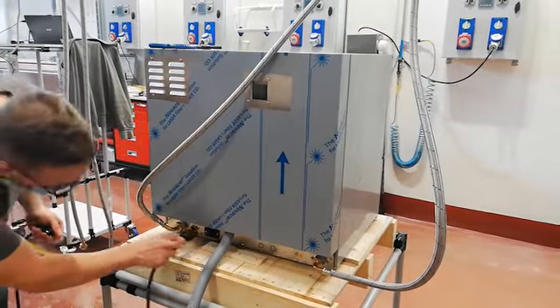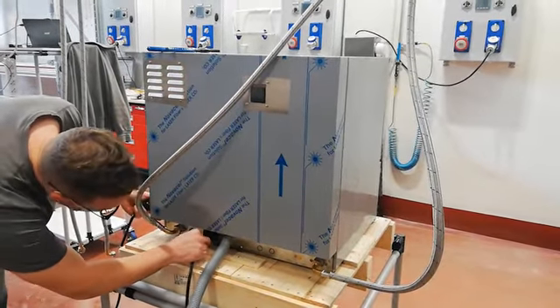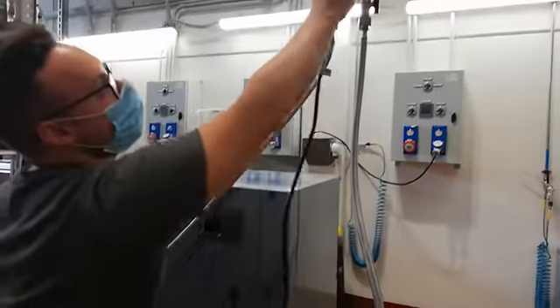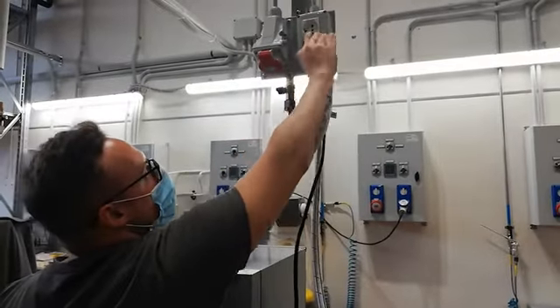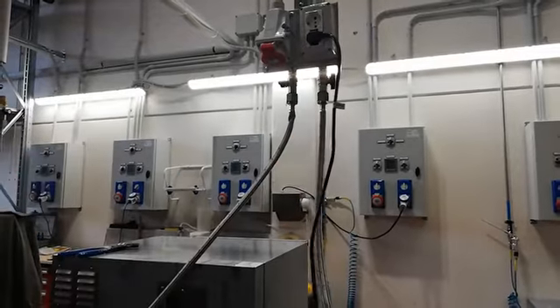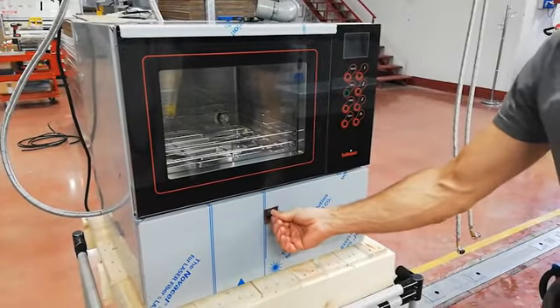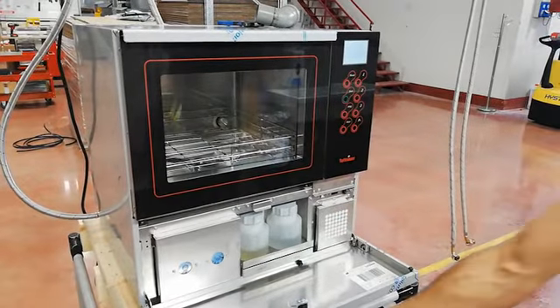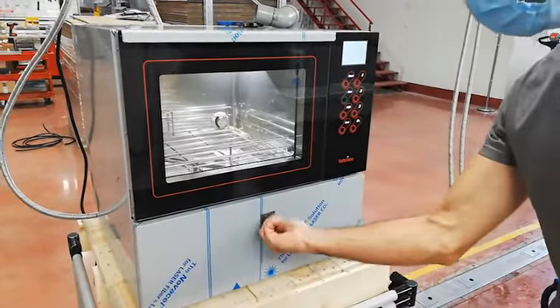Use the supply cable to connect the machine to the power supply. The connector is located on the bottom rear of the machine. Once connected, open the front door of the machine and turn it on with the appropriate switch located under the display casing on the right.